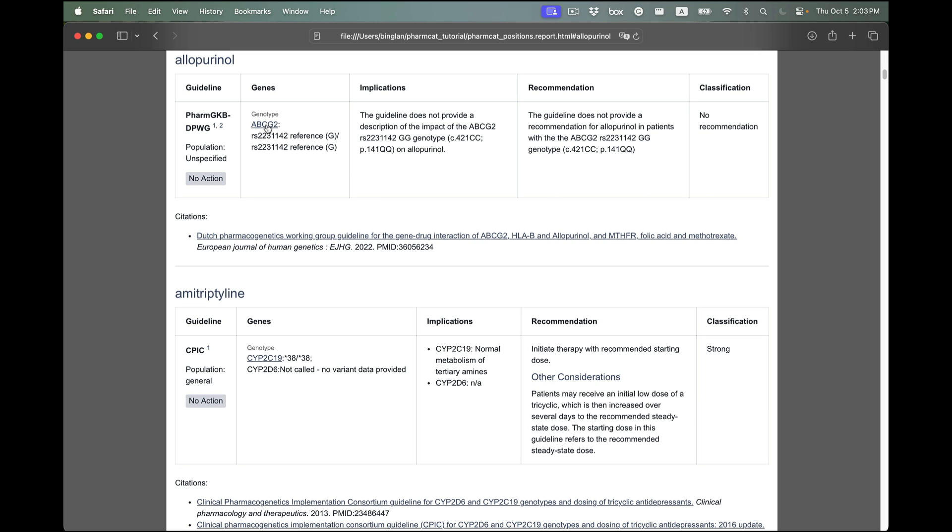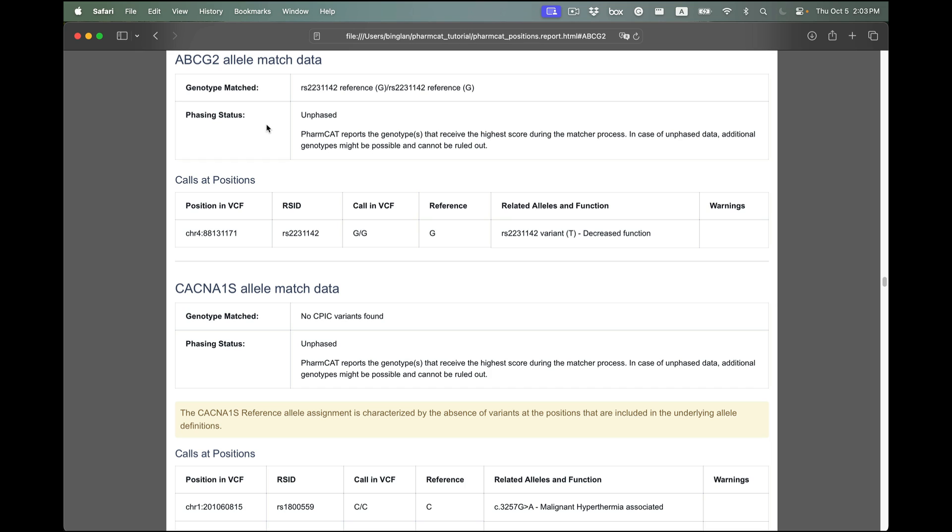In addition, there is a section that lists the PGX variants per gene. In this section, missing variants and other warnings that are relevant to the genotype calling are included.